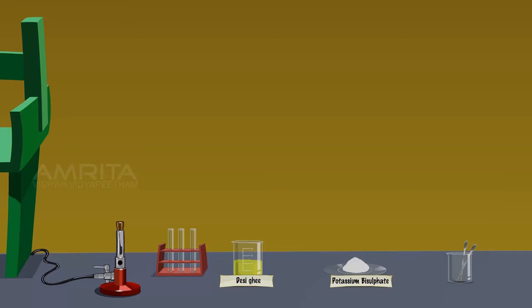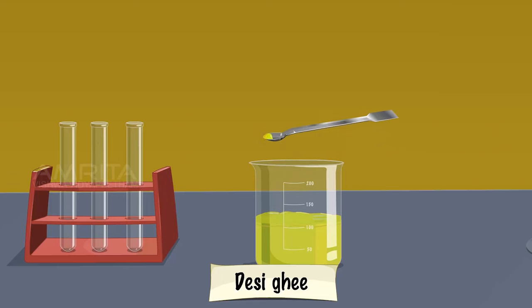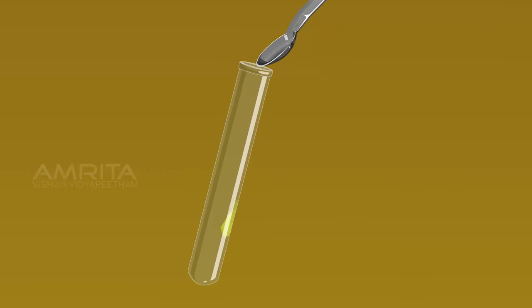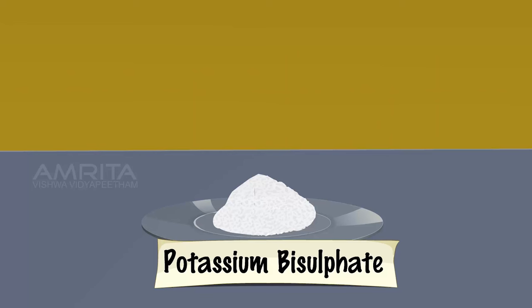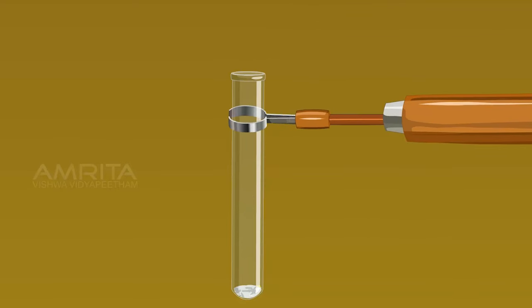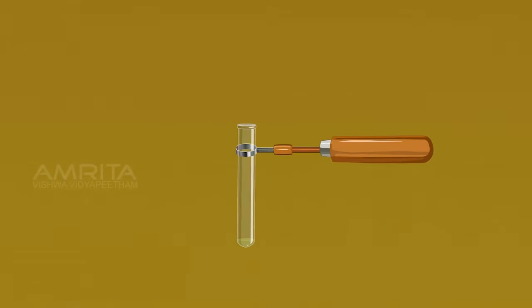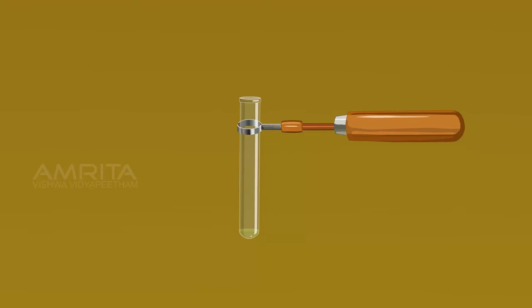Acrolein Test. We require desi ghee, potassium bisulphate crystals, test tube, spatula, and Bunsen burner. Using a spatula, take a small amount of desi ghee in a test tube. Using another spatula, take a small quantity of potassium bisulphate crystals and add them into the test tube. Hold the test tube with the test tube holder and heat it over the Bunsen burner. When fat is heated strongly in the presence of a dehydrating agent like potassium bisulphate, the glycerol portion of the molecule is dehydrated to form an unsaturated aldehyde called acrolein, which has a pungent irritating odour.